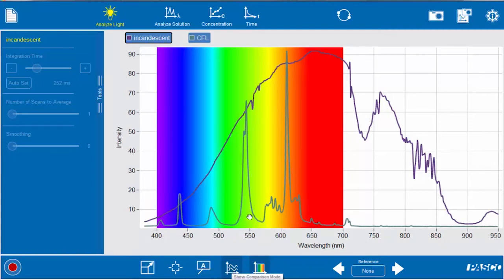So now you can see the difference between the old style incandescent light bulbs, which have pretty much a continuous spectrum, versus the compact fluorescent light which only has emissions at very specific wavelengths. And this explains why quite a few people really prefer natural light or the old style light bulbs to the newer compact fluorescent light bulbs.